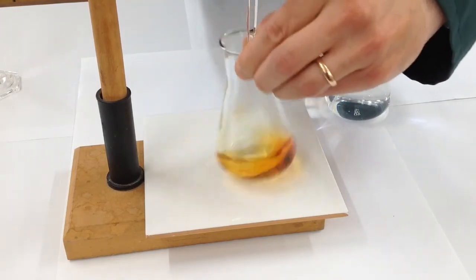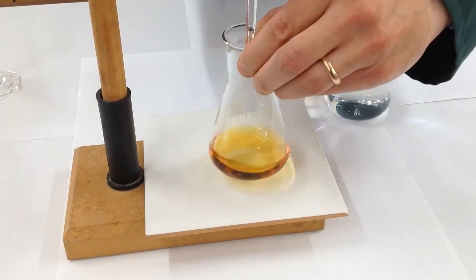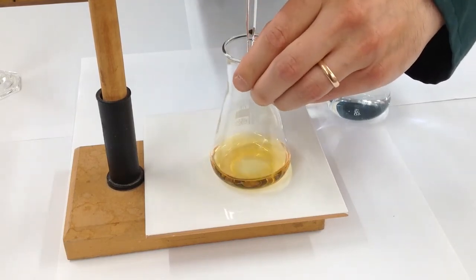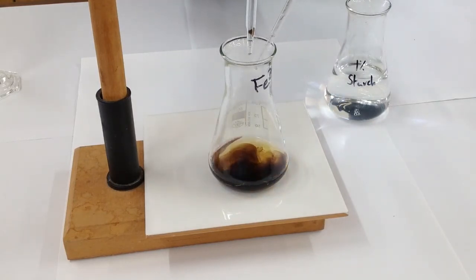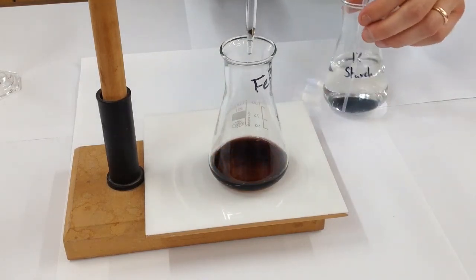Speed up a little, but don't want to overshoot. Just adding little drops. Okay. We're ready, I think, for starch. That pale straw colour. About a millilitre, a centimetre cubed of starch. And we get it going, the characteristic blue-black colour of that starch iodine complex.